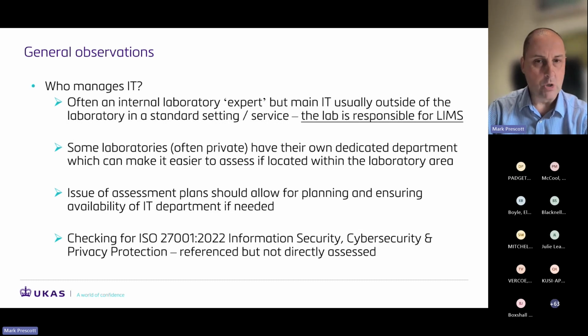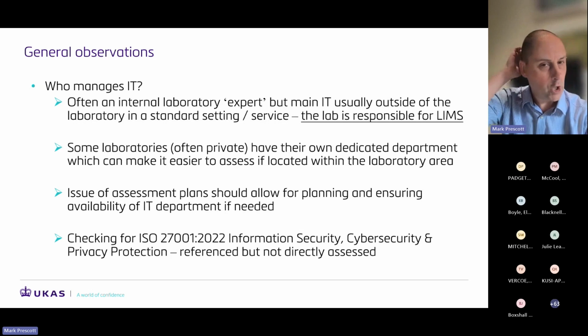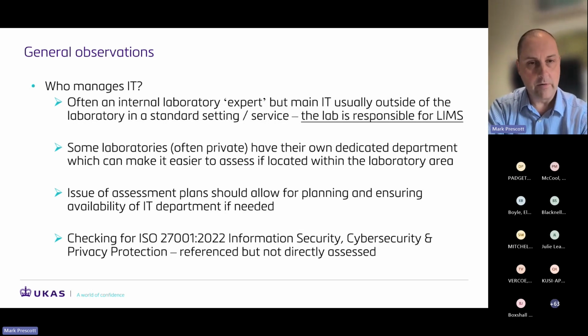I've been to a number of labs over the years where their IT department does have this. We do need to see, it's a little bit like your ISO 15189 schedule, in the sense that you can list specific sites that are covered by that accreditation. This standard is the same. So if you've got a certification to ISO 27001, you can have specific sites assessed on there. And you may see a multi-site laboratory service that has this, and those individual laboratories are covered within that certification.